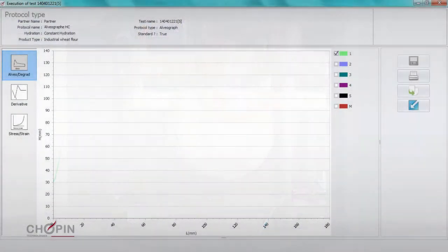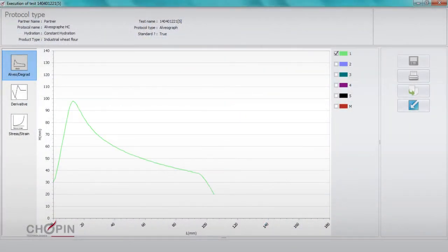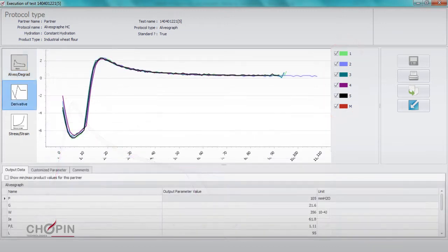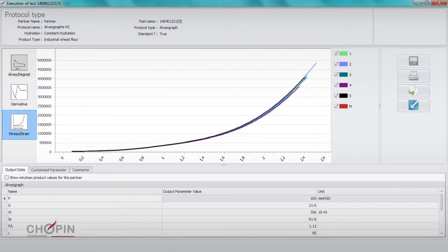The dedicated control software also represents a significant innovation. Straightforward, comprehensive and intuitive, it permits test results to be more comprehensively analyzed. Additional parameters such as first derivative, stress strain parameters and mixing consistency are now available.